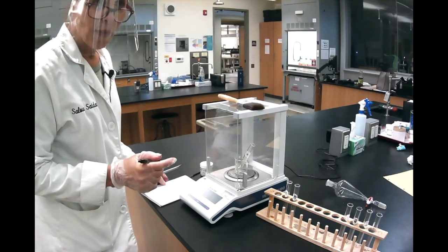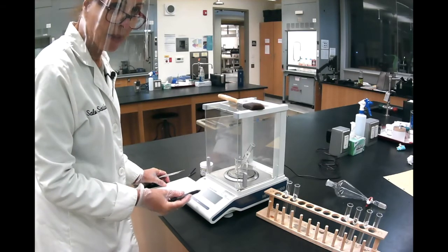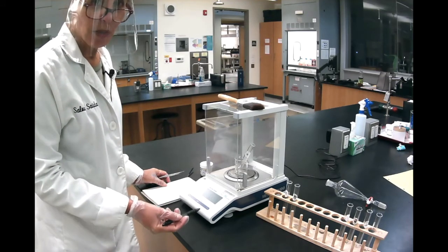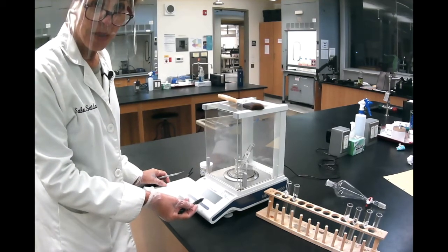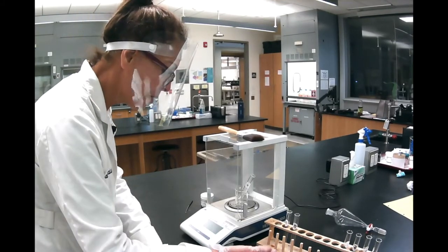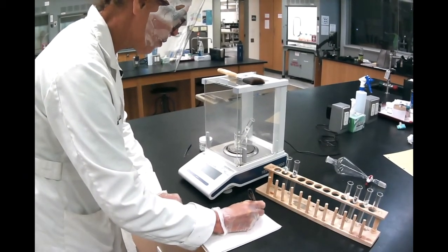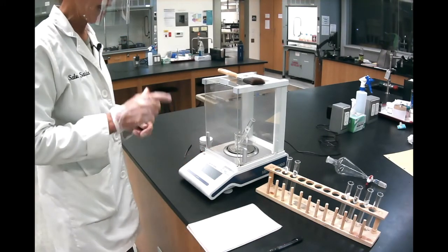Another thing that I observe that students sometimes make these mistakes is that this is a very expensive balance and it goes to 4 decimal places. That shows the precision of the balance. So never drop any digit when you read from an analytical balance, because these are pretty much an indication of how precise your measurement is. So I'm going to write it down here. Mass of tube plus beaker is 44.4577 grams. I know exactly that mass.